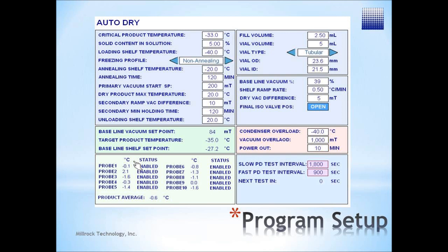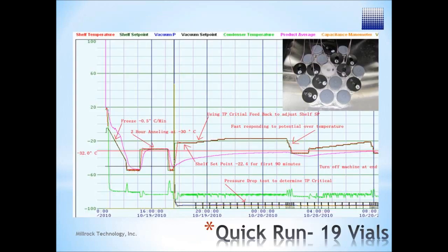This is a sample AutoDry run. Critical fields for data input are critical product temperature, percent solid content in solution, and basic vial dimensions and fill information. The remainder of the fields in the blue area are standard input for the freeze drying recipe. The green area contains calculated points within the freeze drying cycle that are based on data input.